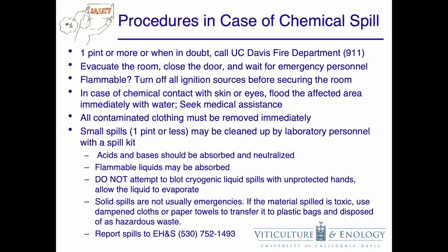If the spill was a flammable substance, turn off all ignition sources before securing the room. In case of chemical contact with skin or eyes, flood the affected area immediately with water and seek medical assistance. Remove all contaminated clothing. Do not be concerned with modesty in the event of a chemical spill. Some labs may even keep spare lab clothing for this purpose.